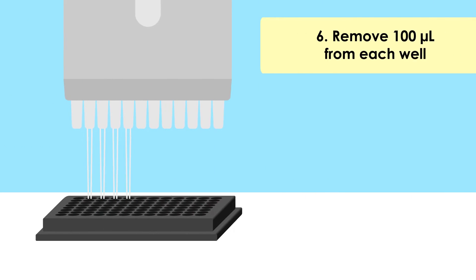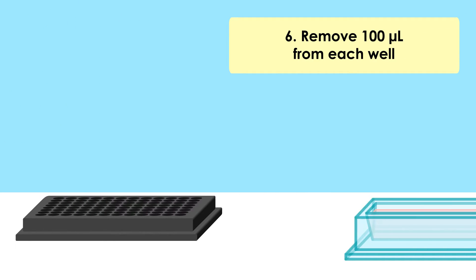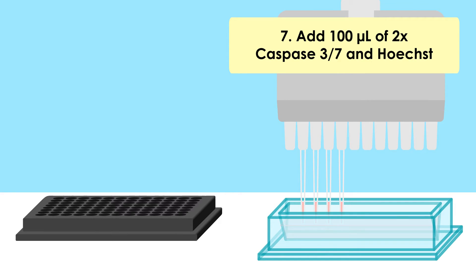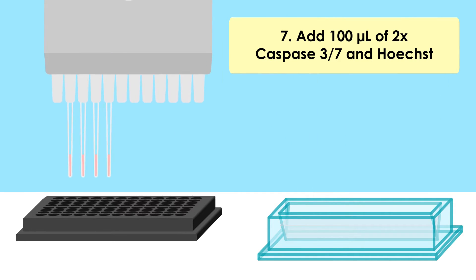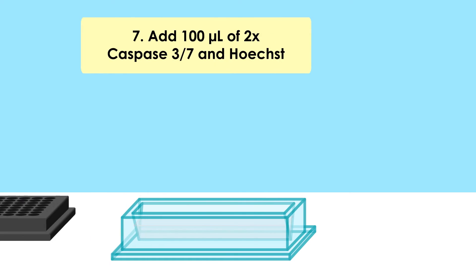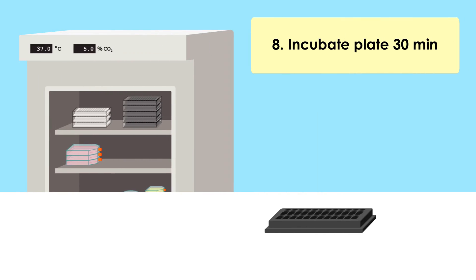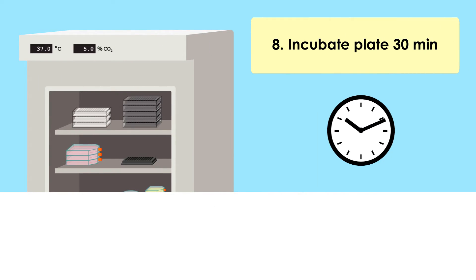After the incubation, remove 100 microliters from each well and add 100 microliters of 2x concentrated Caspase 3-7 and Hoechst staining solution to each well. Allow the plate to incubate at 37 degrees for 30 minutes.